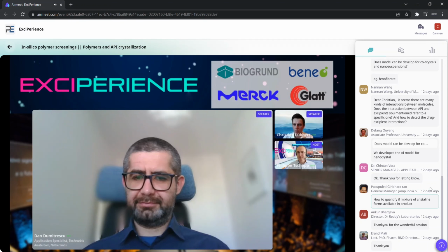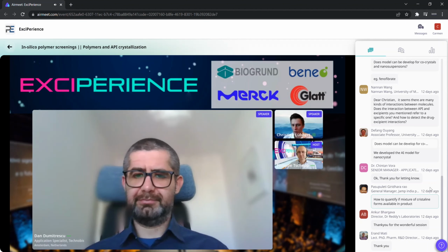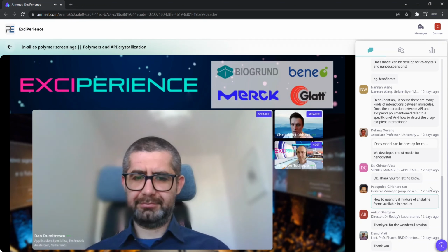I mean, this is, so to say, a shelf life prediction at the most harsh conditions we can think of, namely 100% relative humidity or water activity, and also in a state where the polymer already dissolves in the gastrointestinal fluid. If we replace the storage condition by 100% water activity and maybe even higher drug load than initially stated, then we can also take this to at least estimate the crystallization rate in vivo.